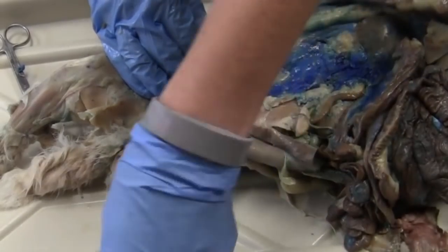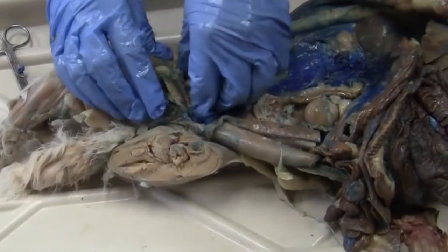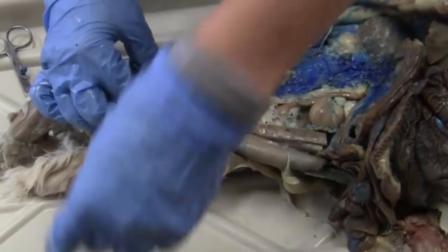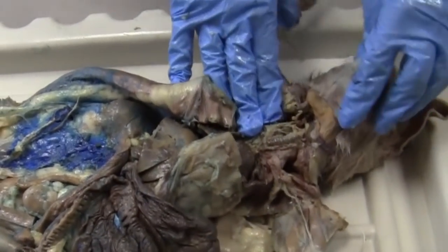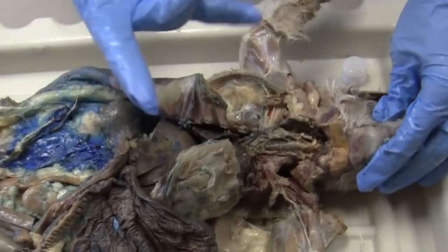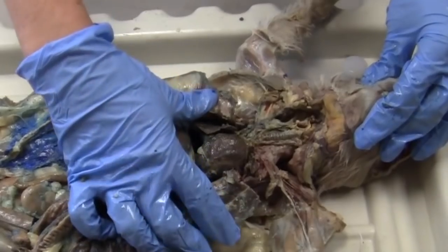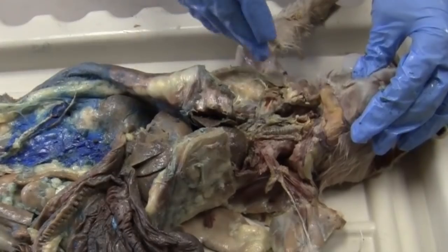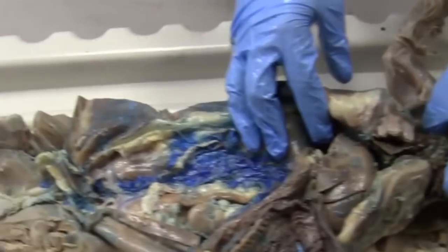I'm also going to pick out some of this fat from this rabbit. Hopefully it will help you guys see better. One thing to note also, I forgot to tell you guys, up here on this part of the rabbit, I did cut the ribs out. You guys don't have to do that, but I did that for video purposes. It's hard for me to hold open the ribs and show you all the arteries and veins. But if it's easier for you to see the arteries and veins, you're more than welcome to cut just the top part of those ribs out.